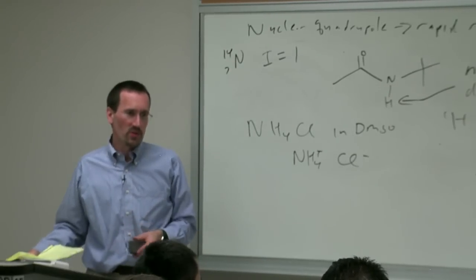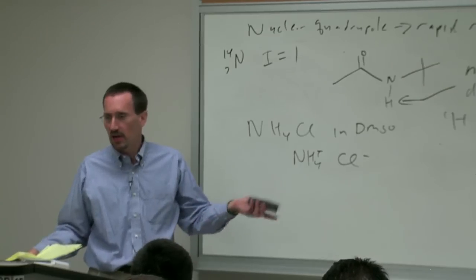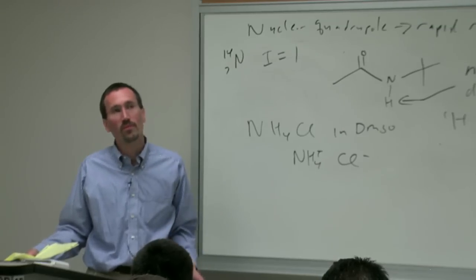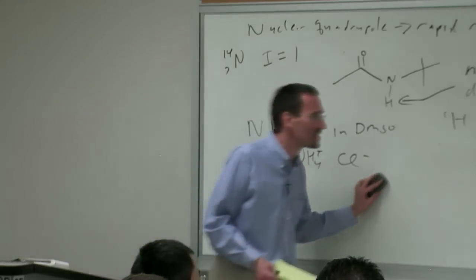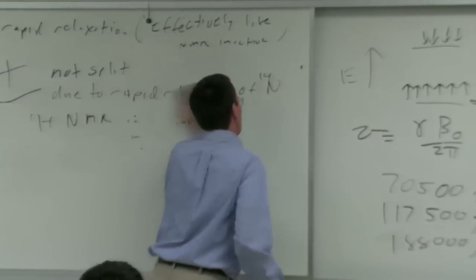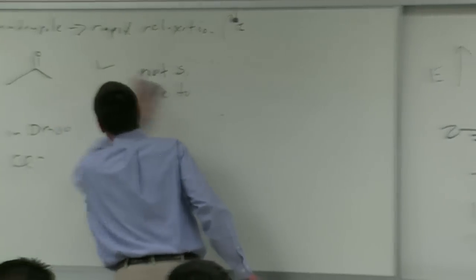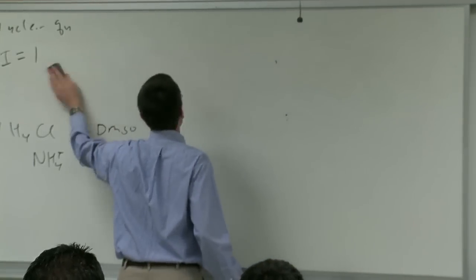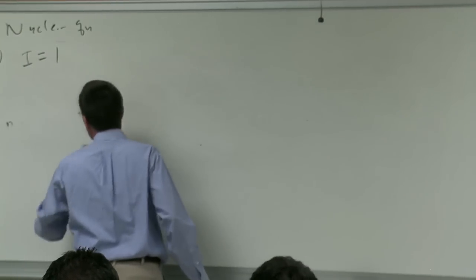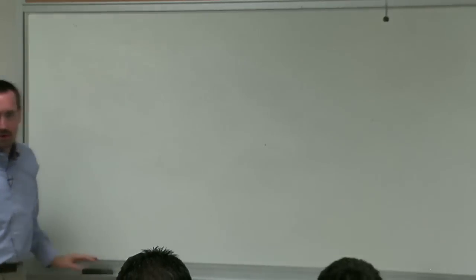And the limits on commercial instruments these days are about 900 megahertz, and the thing costs, I guess ours cost about, for the whole thing, about $2.5 million. And by the time you're at 900 megahertz, it's many, many millions of dollars. And there may be a 1 gigahertz out there, but for now at least, it's in France or something. I think so. We really seem to have just pushed the limits of technology for how much electricity you can put in a superconducting coil without it just ripping itself apart.